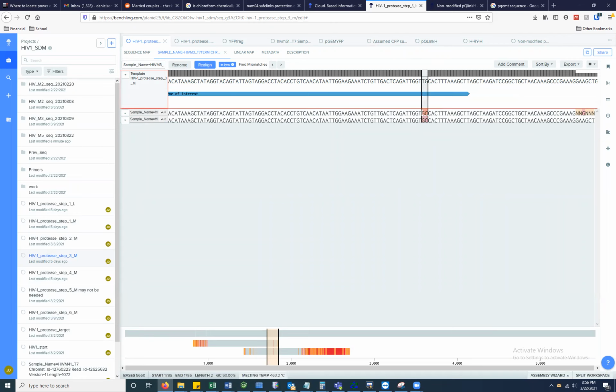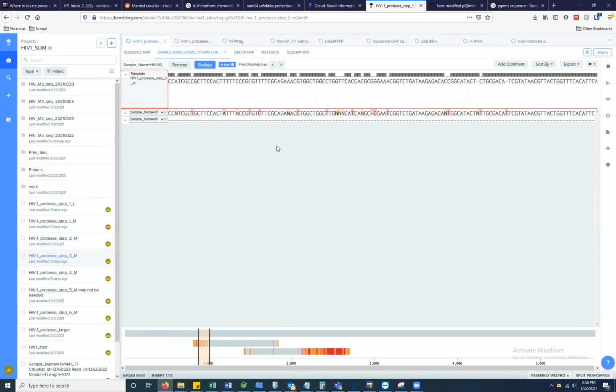So that would mean you had a change induced, or a change induced you didn't expect, or that it added in bases, which isn't likely because the rest of it lines up pretty well on both sides. If you had a dash mark here, that would indicate that the template is missing something, as an insert. So it's hard to simulate that. I might be able to do it down here. Here you go. At least I thought. I guess not.